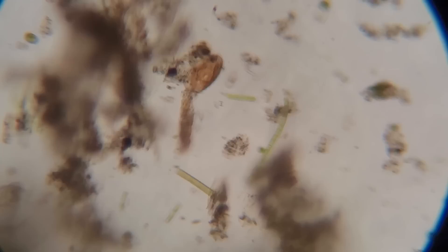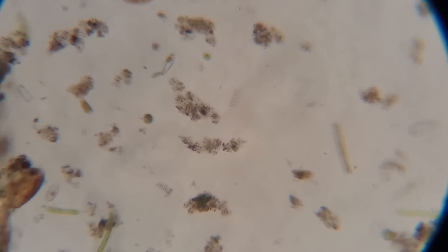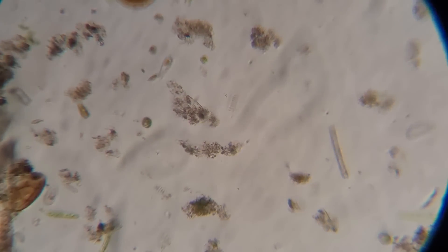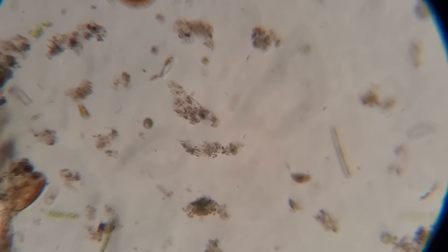Looks like we have another little crustacean exoskeleton there, as well as all sorts of little teeny life forms cruising around. And if we change the aperture, we're going to see even more little creatures in this tiny — not even a full drop of water — that was put on here. Come back for more, or check out my live streams where we dig through different tanks if you're into this. But, back to the filters.